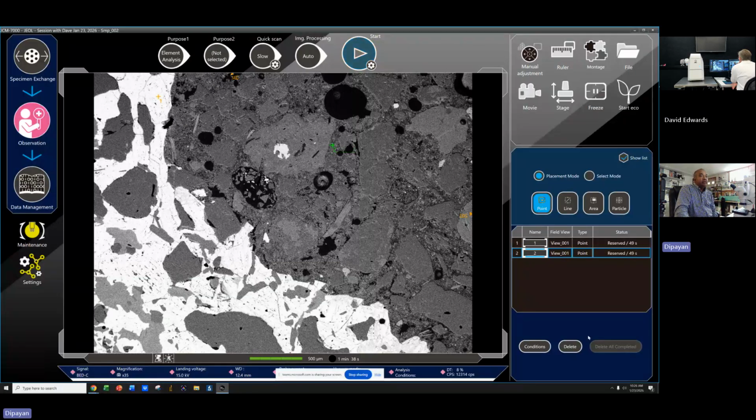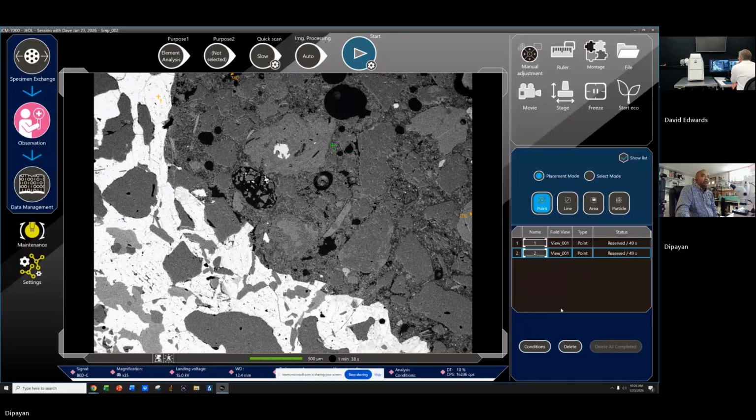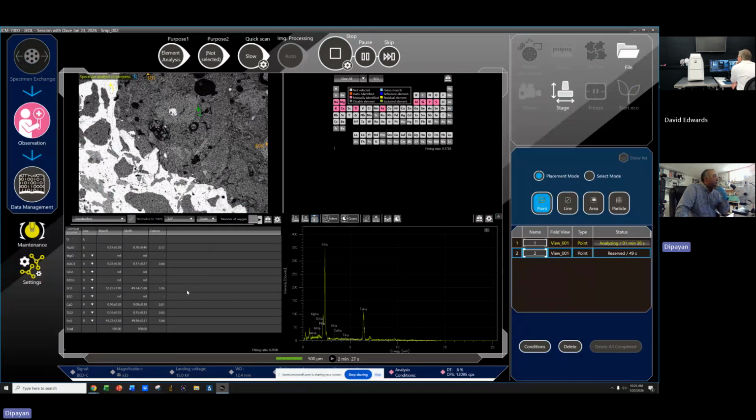Yep. Okay. Now, look, there is a condition coming up here again. Do I need to worry about that condition at all? You've already done it. You don't need to do it again. Okay. So I will ignore that and then I will just say start. And now, once I get the 2, I do two things here. See, the first one is a metal, right? The second one is a silicate. So I'm going to have the first one in the metal mode, which I can change later. And the second one, I will stay in the oxide mode.